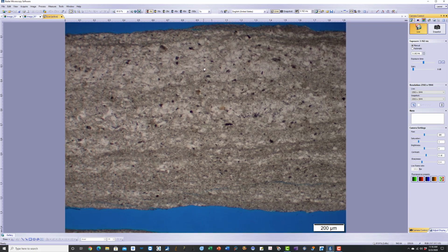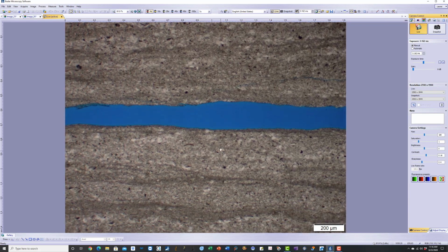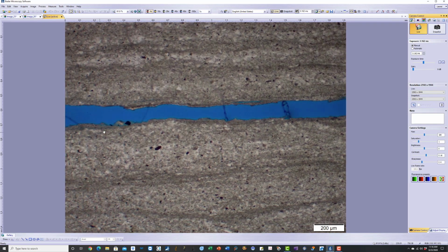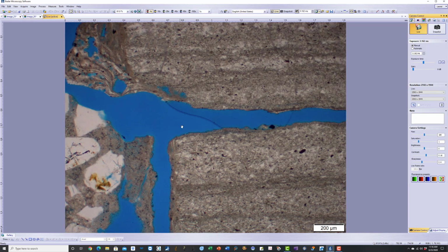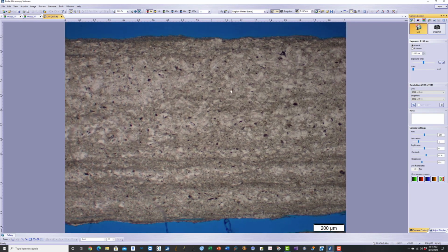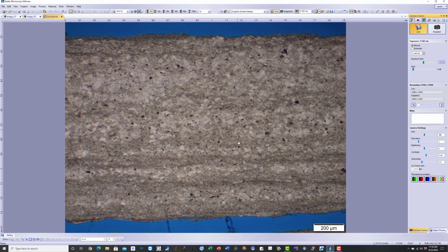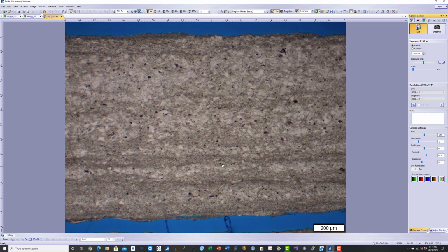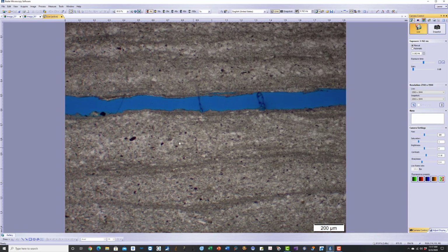And this is the entire section of the paver which has been scaled off from the main body. So that's the scale, the delamination plane, you may say, where this portion, about 0.2, 0.4, about a millimeter thickness. If this is 0.2, about 0.1, 2, 3, 4, 5, about 1 to 1.2 millimeter thickness portion of the slate has been scaled off, flaked off from the main body.